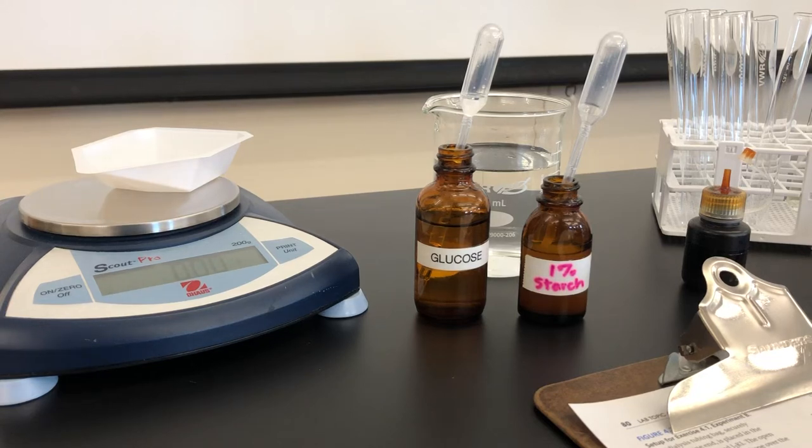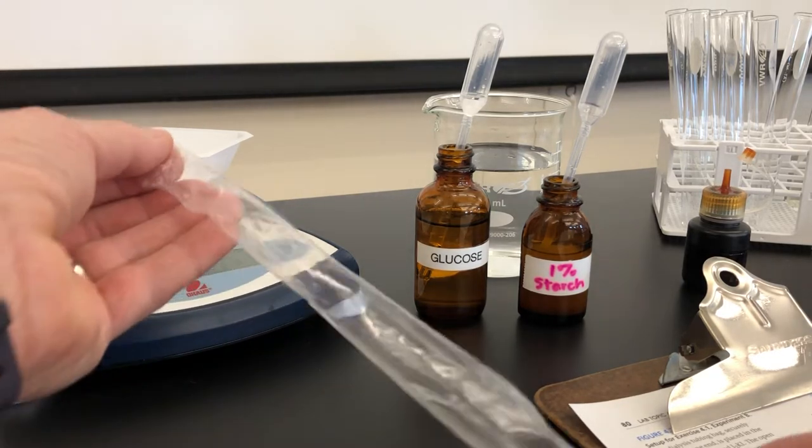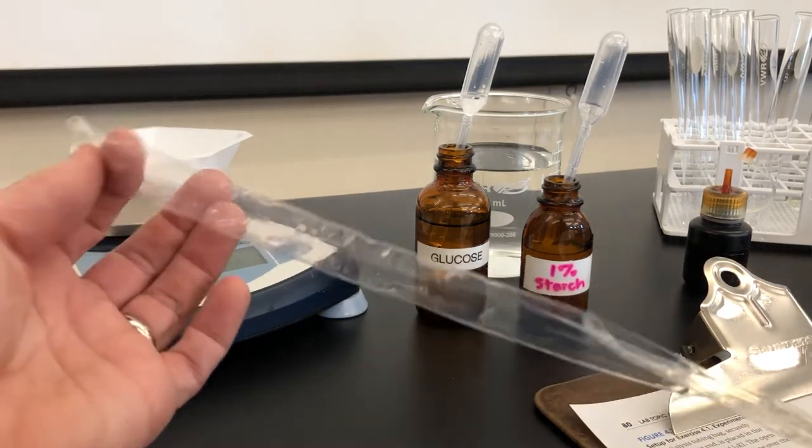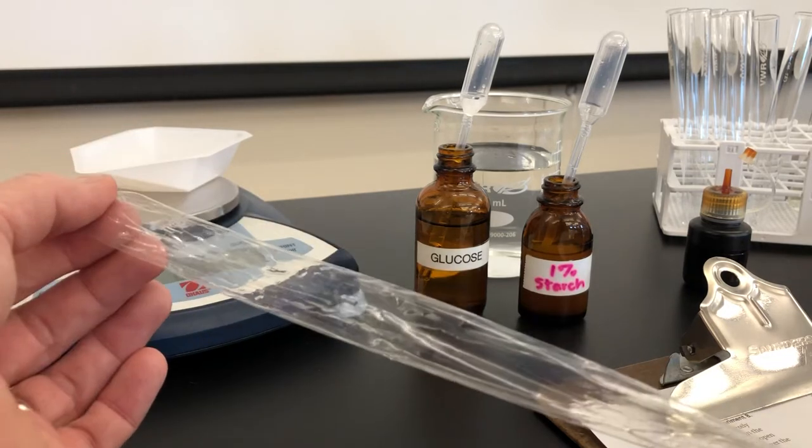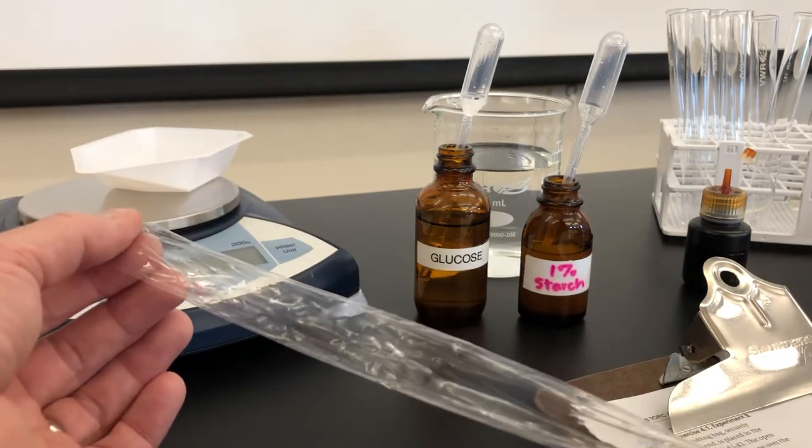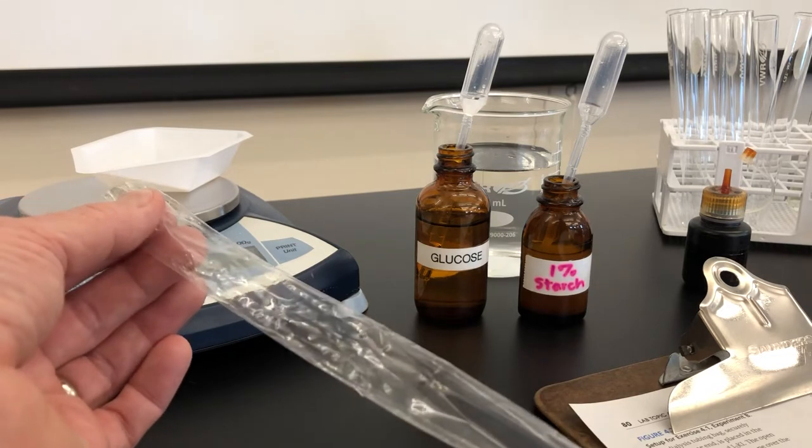This is the setup for experiment B exercise 4.1. In this activity we are going to use something called dialysis tubing. Dialysis tubing is a synthetic membrane that is used in dialysis machines for patients who have kidney failure.